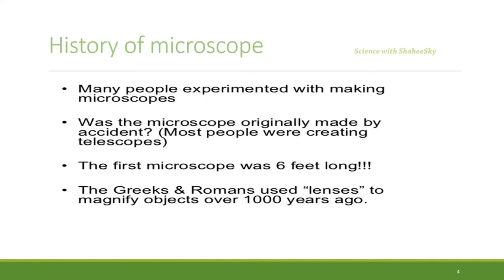Let's move on to the history of microscopes. Many people experimented with making microscopes. The first microscope was 6 feet long. The Greeks and Romans used lenses to magnify objects over 1000 years ago.